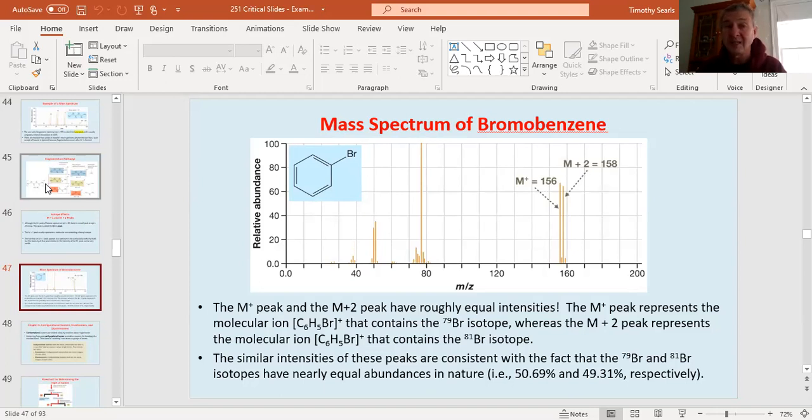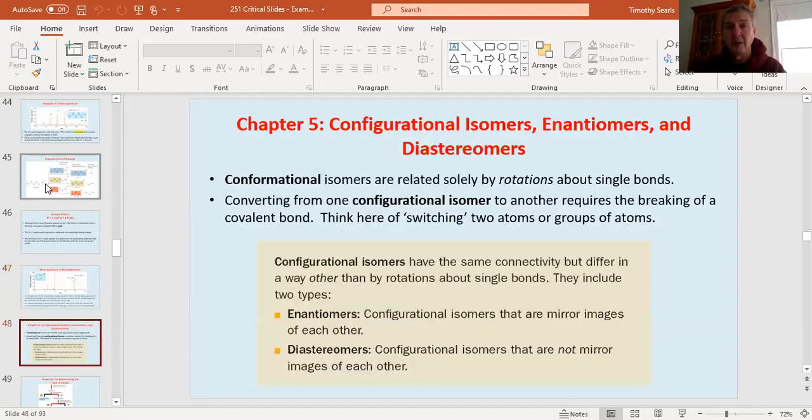So you can see that from the ions or the isotopes that might occur, you can get information you wouldn't have otherwise. Chlorine might be 3 to 1, because it's a 35 to 37 isotopic ratio. So that's really powerful in mass spec as well.